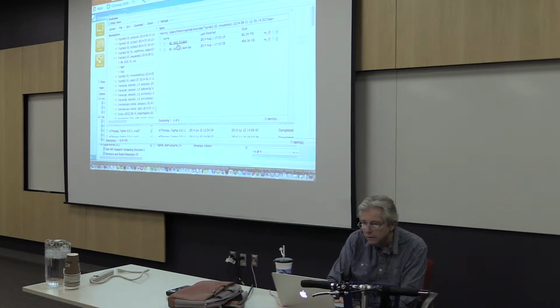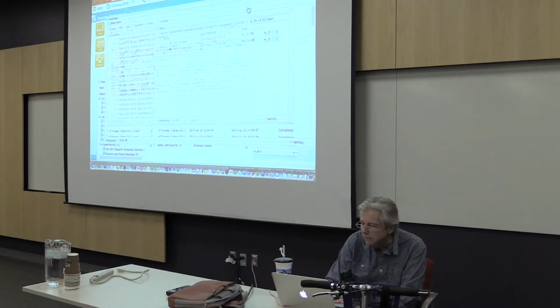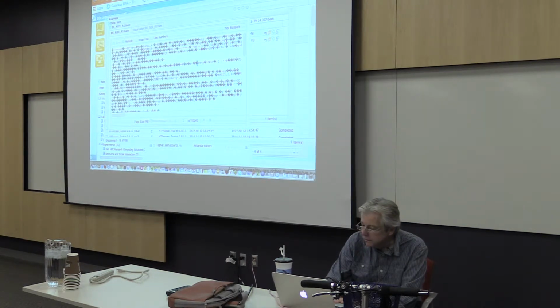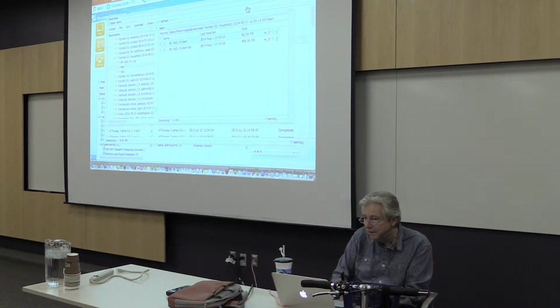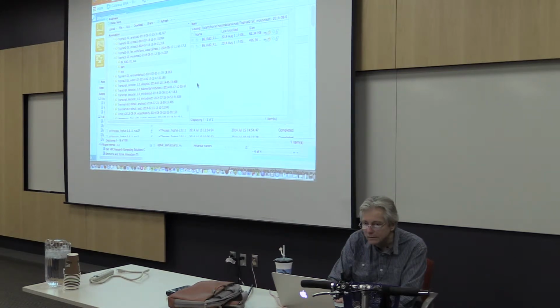But you also have here, conveniently named to match your input files, this BAM file and the index file for that BAM file. And I forgot, the BAM indexes are binary. BAM files are binary. But don't be afraid to look at it, just so you know. It's binary. That's what it's supposed to look like. I look at it sometimes anyway. There's stuff in there. It's a binary file. At least I know that much.